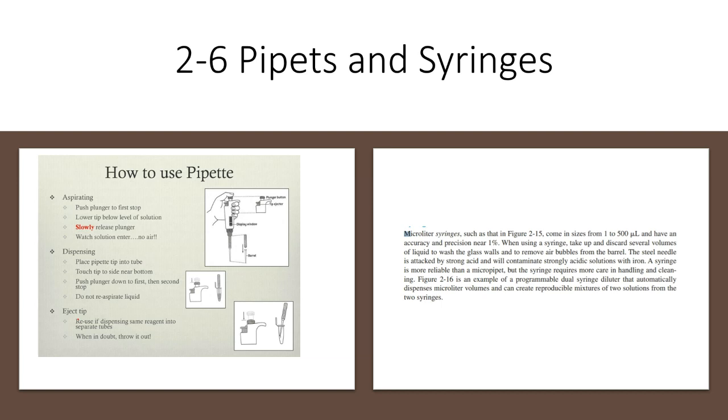When dispensing, place pipet tip into the tube. Touch tip to side near bottom. Push plunger down to first then second stop. Do not re-aspirate the liquid - it's going to give you inaccurate volume and inaccurate results. Eject the tip means to reuse if dispensing same reagent into separate tubes, and when in doubt, you need to throw it out.